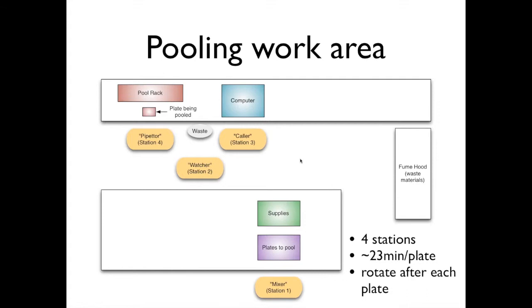And also we calculated time involved in monitoring the robot. A robot, we calculated, could not work anywhere near as quickly as a human because of the rinsing involved with reusing pipette tips for a robot. And the expense would be high per pool.